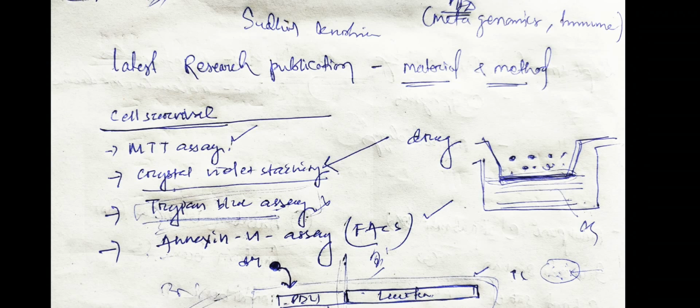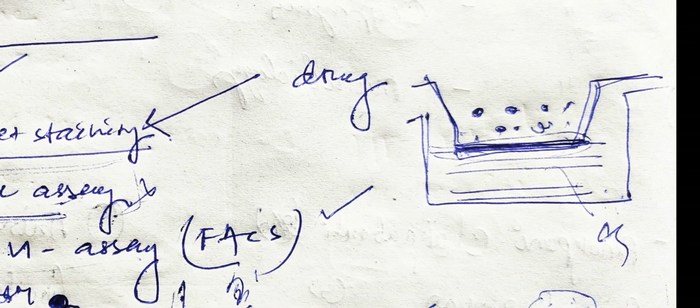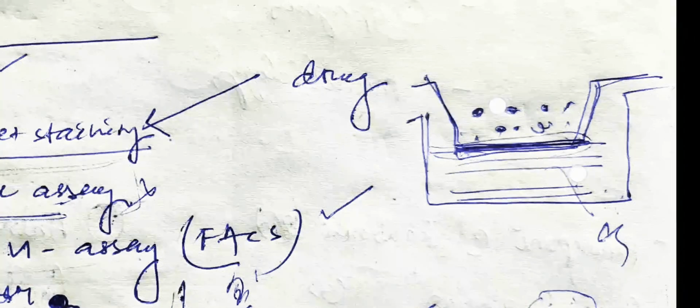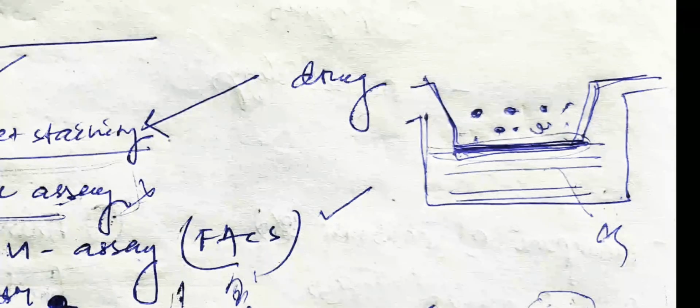Forget about this. In this picture here, it shows the migration of the cells when particular chemicals are applied. So it shows whether a cell line is moving towards those chemicals, or is affected by the chemicals, whether it gets synchronized or moves towards anything else.